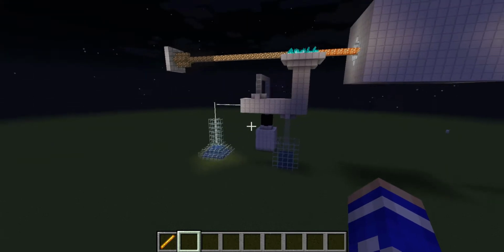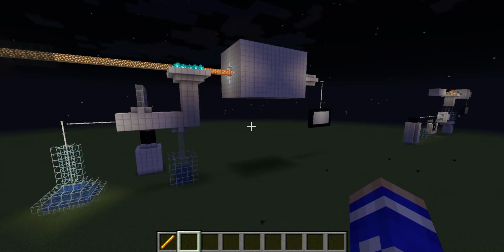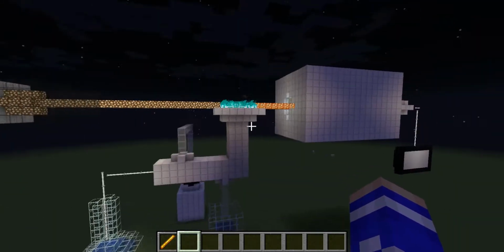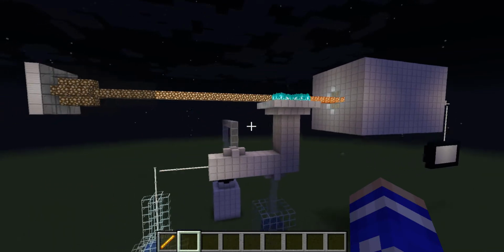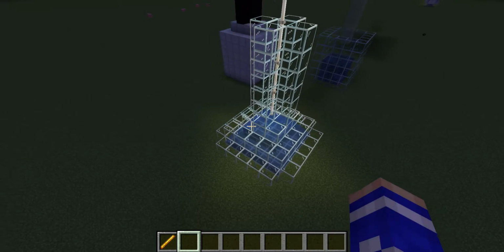Okay, so we're looking at the three types of spectroscopy today. First one here will be absorption spectroscopy, and the device we're going to look at specifically is atomic absorption spectroscopy. So, our first element here, we have our sample.